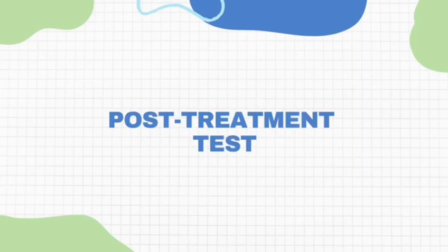Post-treatment test is a retesting after treatment to detect and analyze the parameter of water. The procedure in a pre-treatment test is repeated to check the value of turbidity, pH and COD using filtered water. The data of water sample of pre-treatment test and post-treatment test were compared.